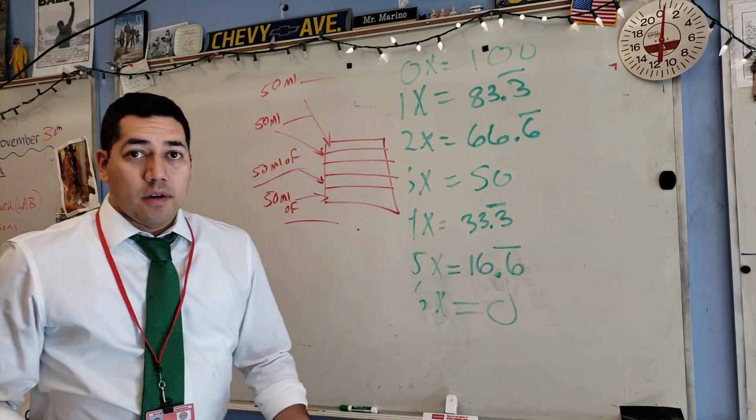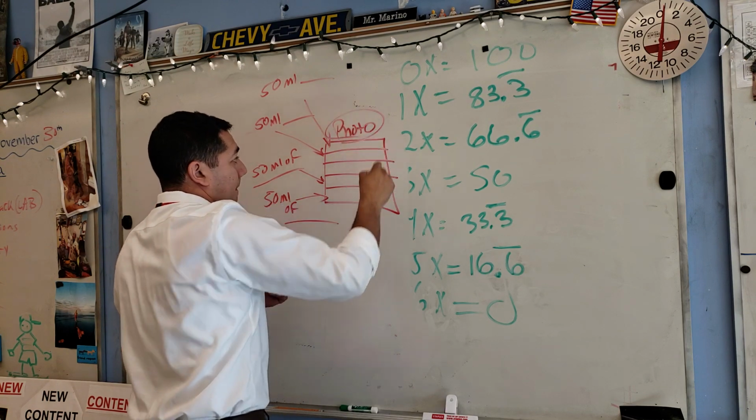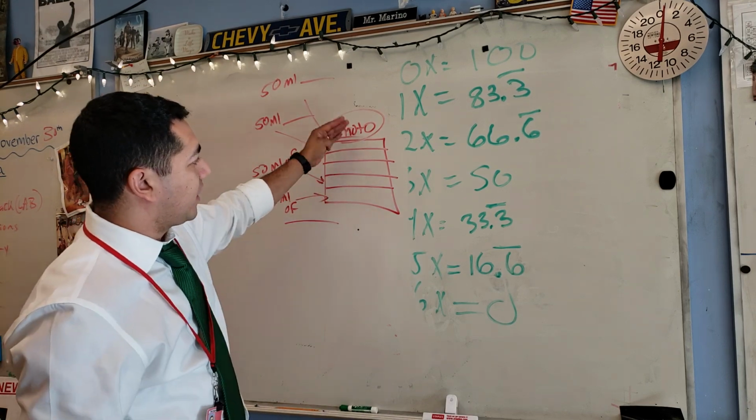Okay? That's going to be the picture. You're actually taking a photo of the finished product, and you're going to name each one that goes in there.